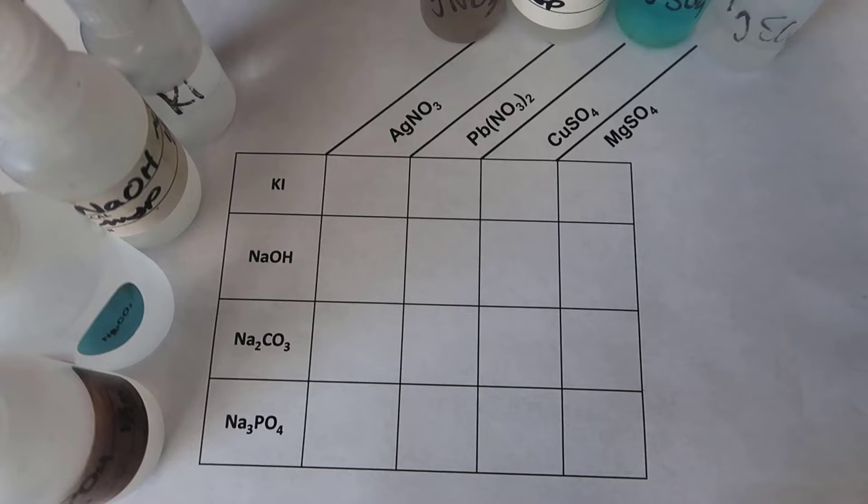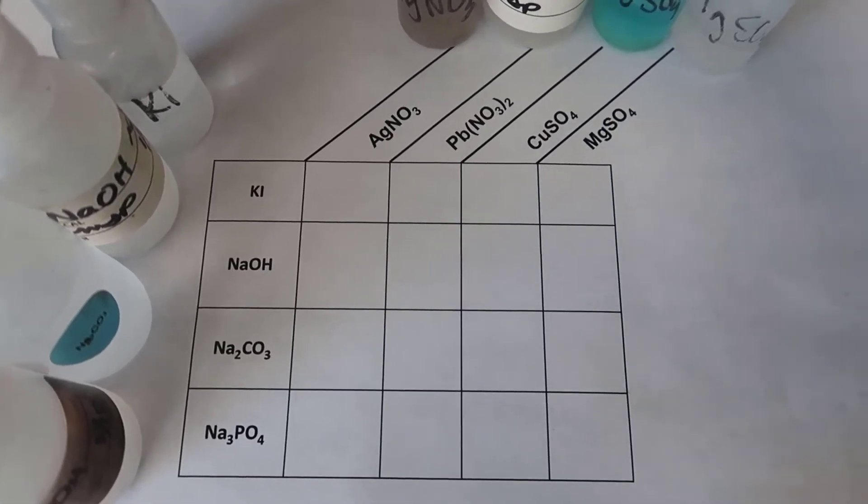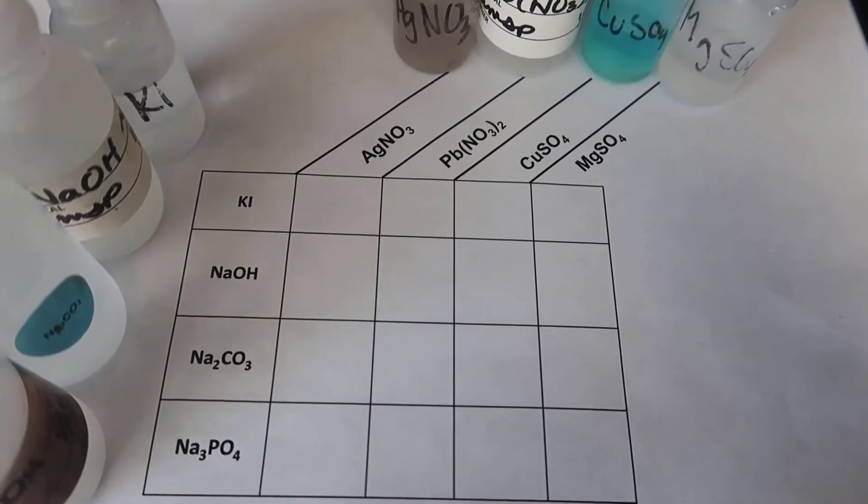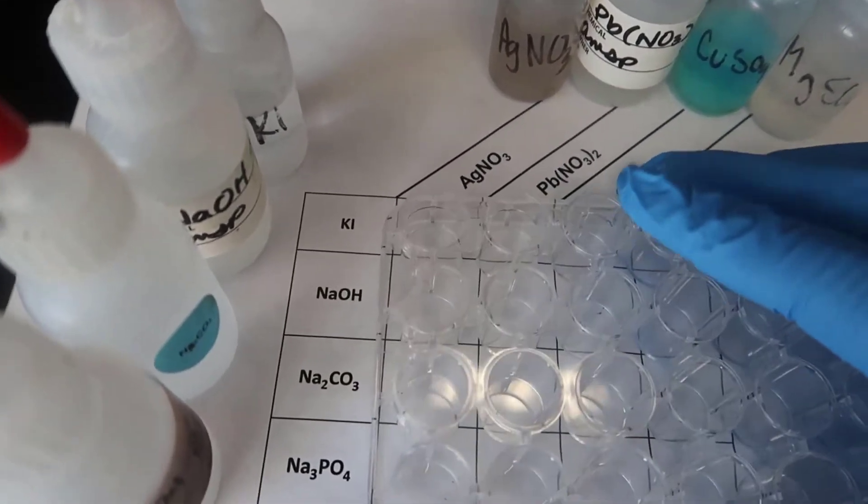And so if you don't have a data table that looks like this, I would recommend that you create one. And I am going to take two drops of each of these ionic solutions and put them into a single well plate.